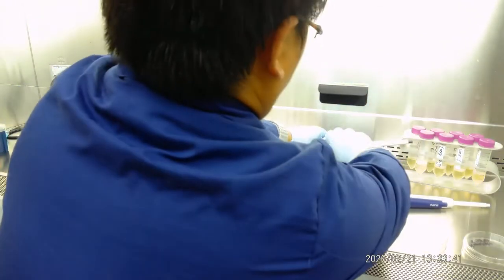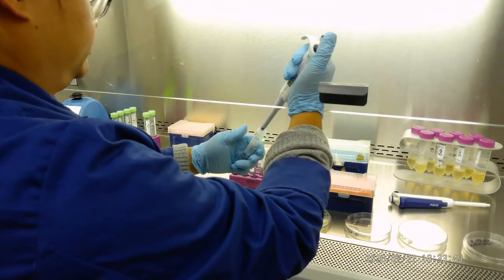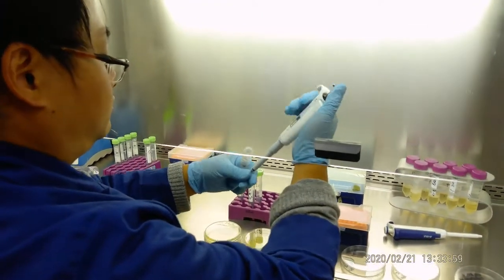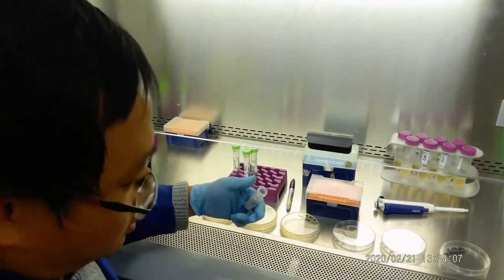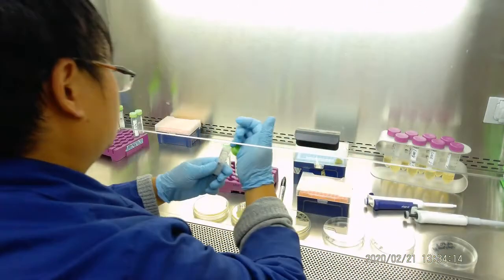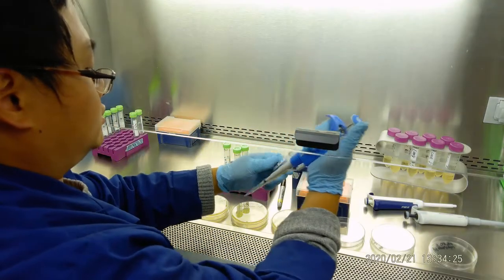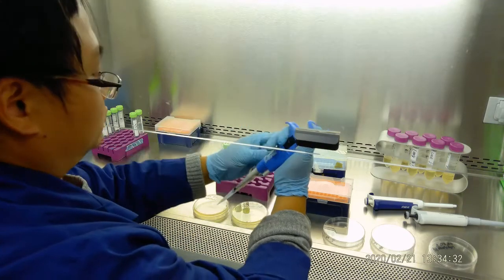So what we do, we're going to change our pipettes. We're using 1 ml, and to this one right here, we're going to add 1 ml. So this one is actually wrong. We have to get a new pipette. This one doesn't work. Sorry, sometimes it happens in the lab. So we have to change to a new one. So here we're going to add 1 ml, and this one goes to here.